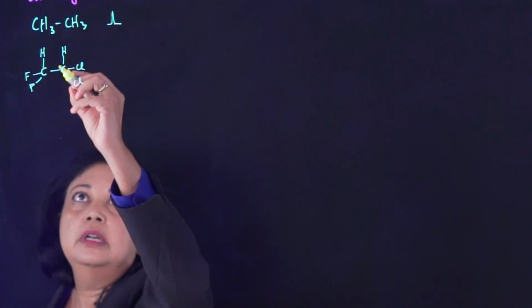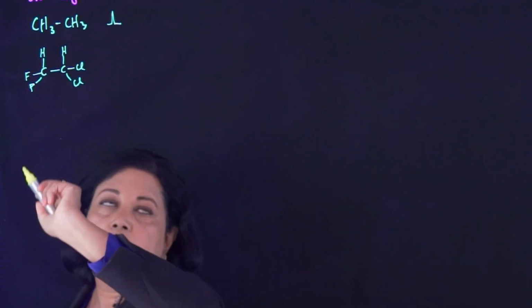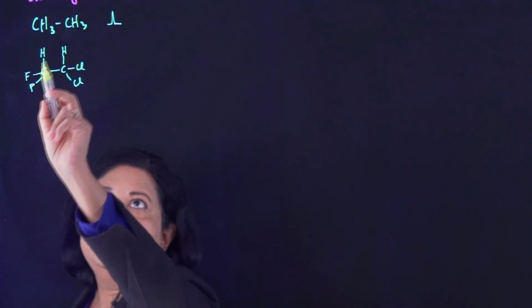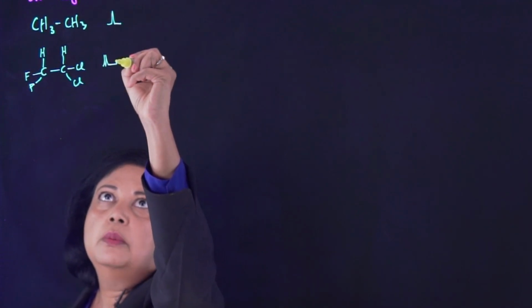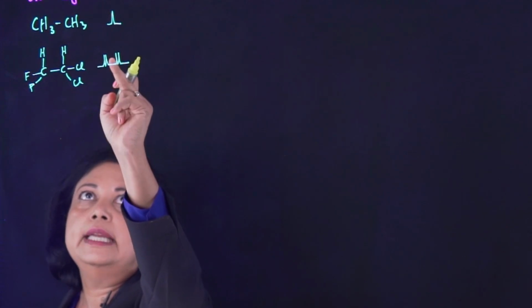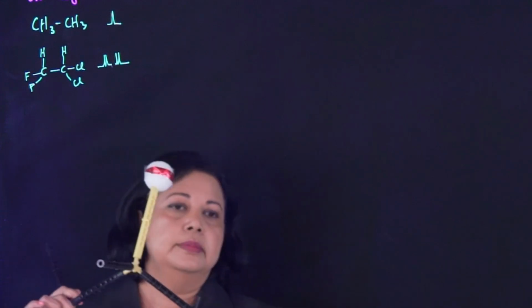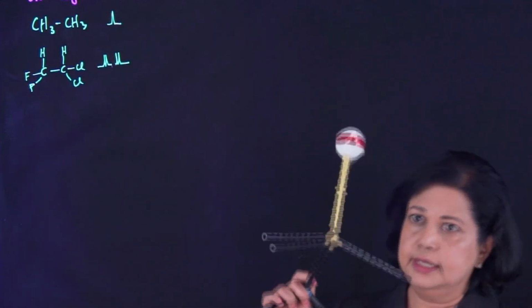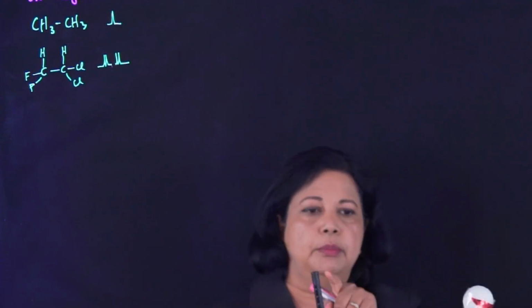So here you would see a peak for this and a peak for this because they'll have different chemical shifts. And these are going to split each other. And we are going to see what's the meaning of this and what does it take to give you these fine splittings. So let's look at some situations. Let's take a hydrogen that has no neighboring protons 3 bonds away.